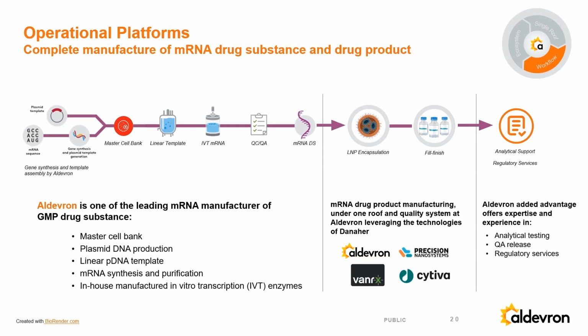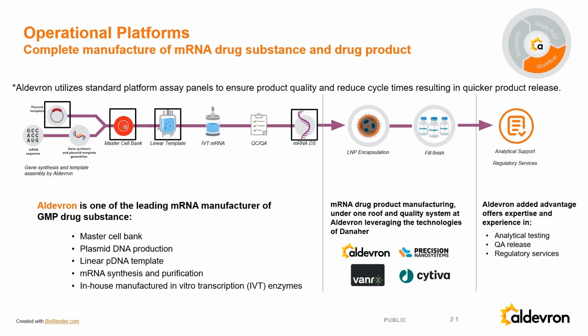And so really what this has allowed us to do is support what you see here from a manufacturing perspective with a robust analytical platform to make methods, develop methods, transfer methods over into method validation, qualify or validate methods, and then implement them into QC to support the release of these products. And so this is sort of what I'm trying to show here. And this will be a bit of a transition into the next few slides.